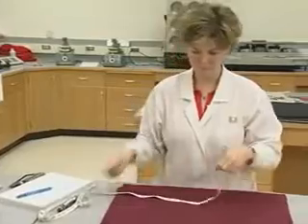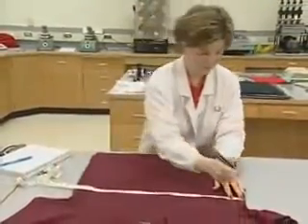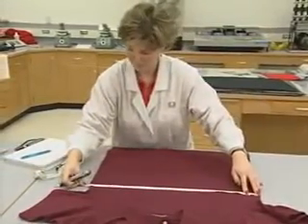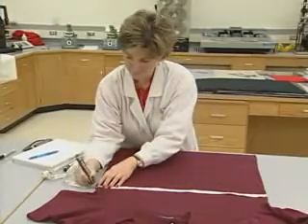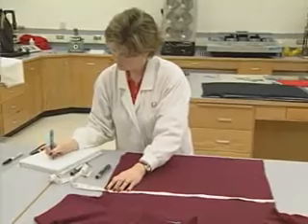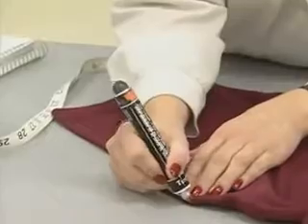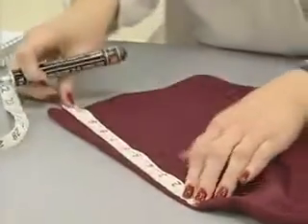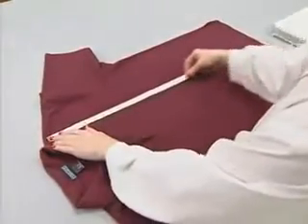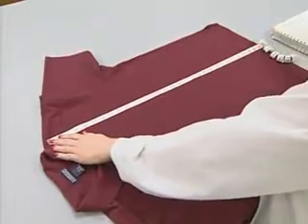As mentioned, garments are evaluated for shrinkage with a slightly modified test format. With garments, the determination of dimensional change is based on the location of benchmarks. This is important because garment construction, sewing threads, sewing tensions, and trim may affect the fabric and garment dimensions. Therefore, predetermined and agreed-upon benchmark locations are used. These are covered in detail in AATCC Test Method 150. Knit shirts are evaluated for shrinkage by using benchmarks and, in some cases, with shrinkage squares.